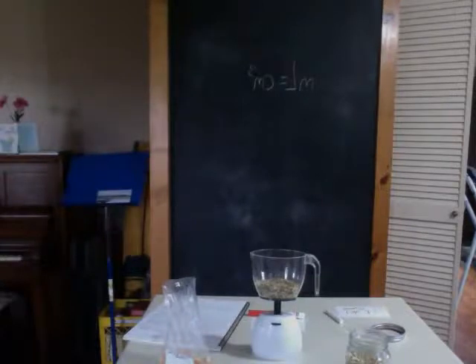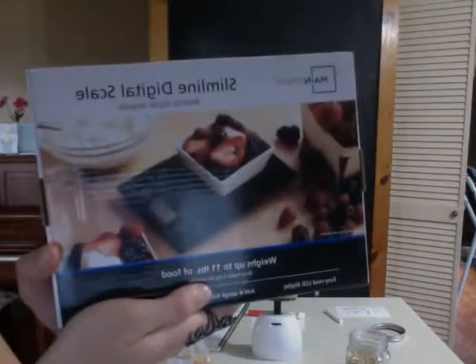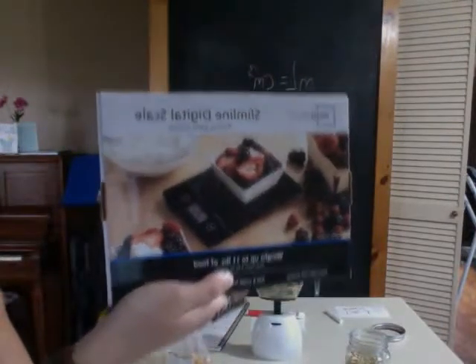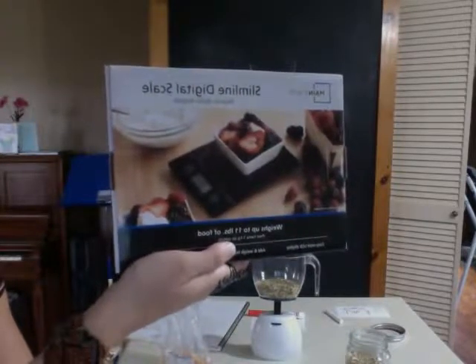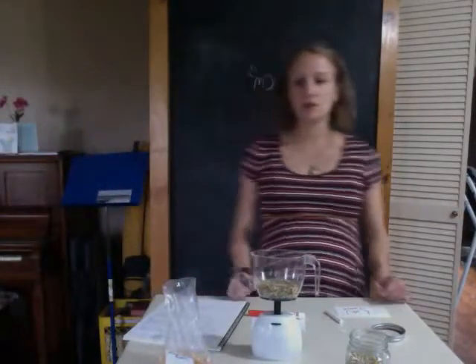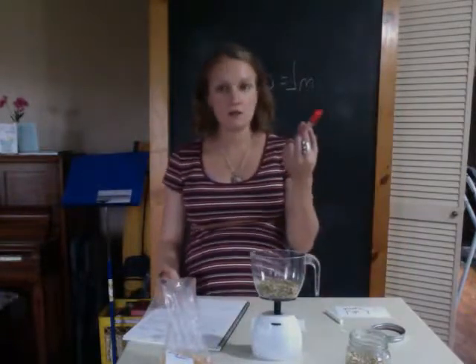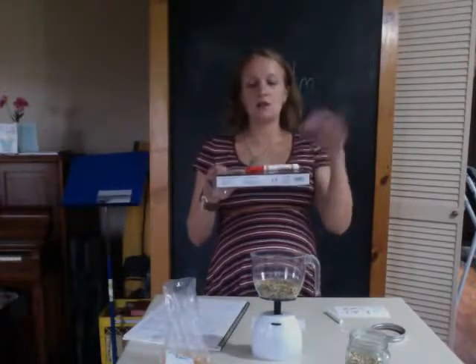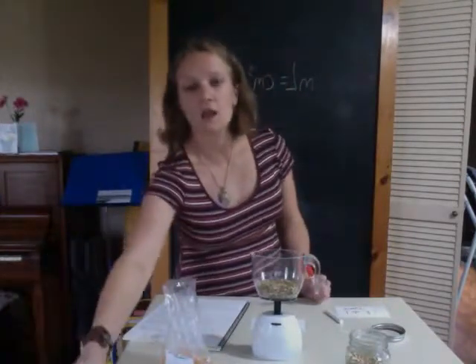The other type of scale would be a digital scale. And that is something like this, something shown here. So I'll be using that for later experiments, but you can always use this and just choose two different objects, such as pennies before 1981 and pennies after 1981, to determine the difference in their masses. So you have two options here. I'm choosing to measure something in terms of volume. You can always also take, for example, if I had two different brands of markers, I wanted to measure 3 different markers using the digital scale, I would just set it on, write down the weight, do that 3 times for each type of sample, and then use those for my calculations.